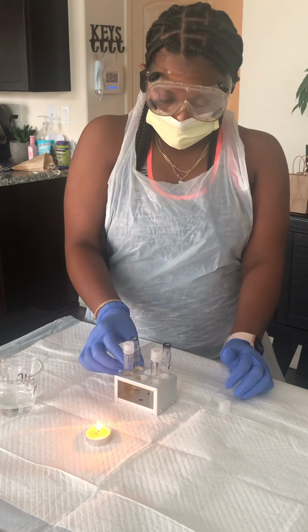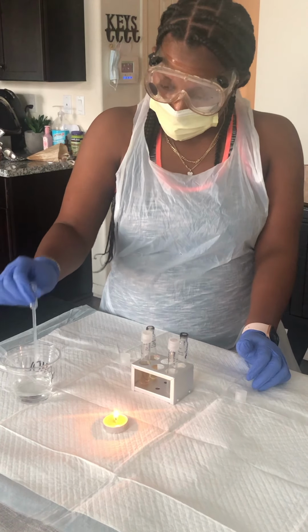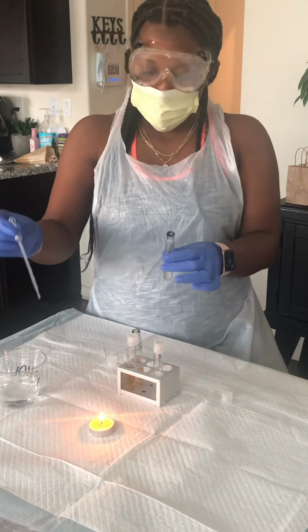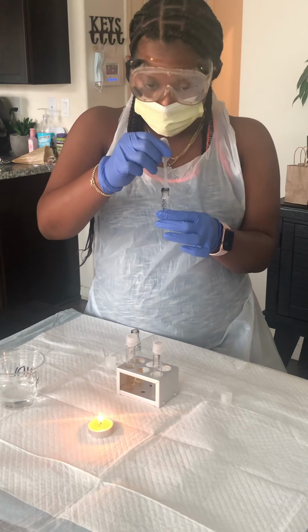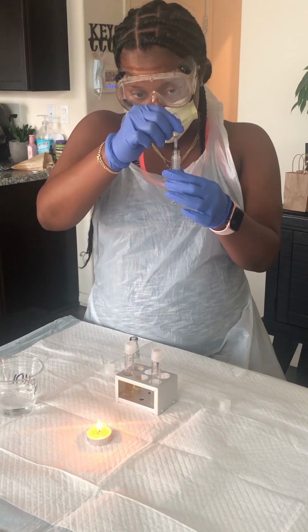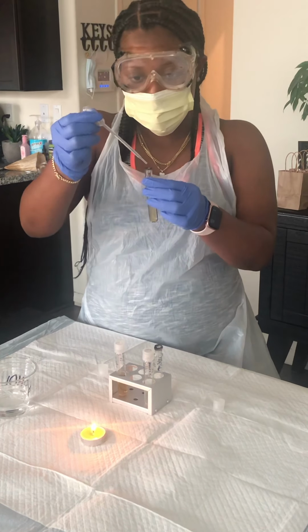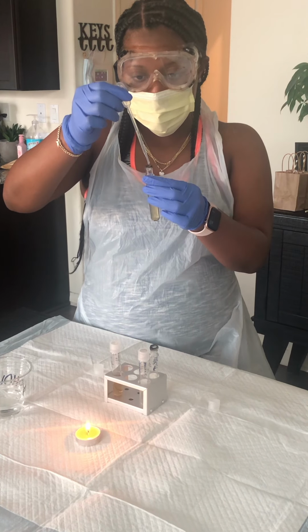Okay. And I'm gonna take my pipette out of my alcohol, being sure that all the alcohol is out. I am going to grab my E. coli vial, inserting the pipette without it touching the edges. And I'm just going to grab some sample here. And I'm gonna place 4 drops into my broth. 1, 2, 3, 4.